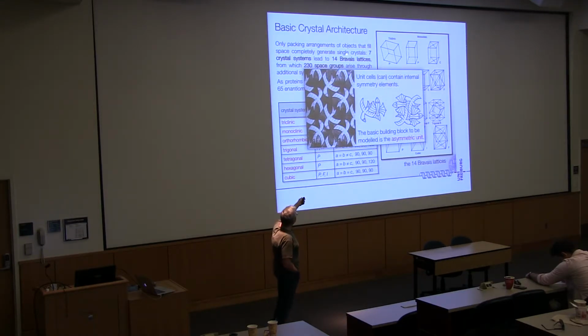So this is a two-dimensional crystal, right? You managed to co-crystallize these birds with these flying fishes. Congratulations. And if you look at it, then quite obviously, the structure that you're after is a bird and a fish. So your structural model should be a bird and a fish.